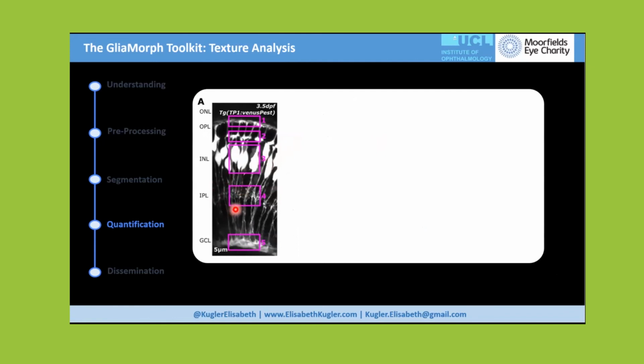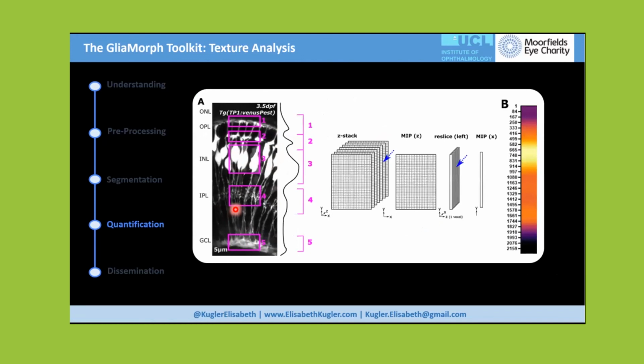So we said, okay, could we make use of this and actually use this intensity information to plot it from this apical to this basal position and let us inform about these different subdomains? And so in theory, what we thought is that if we take this 3D stack and collapse it down into 1D, that we would see something like this in terms of pattern, and then we can just plot it like a heat map like this with apical to basal, and white/yellow is very bright and purple/black is more dim.